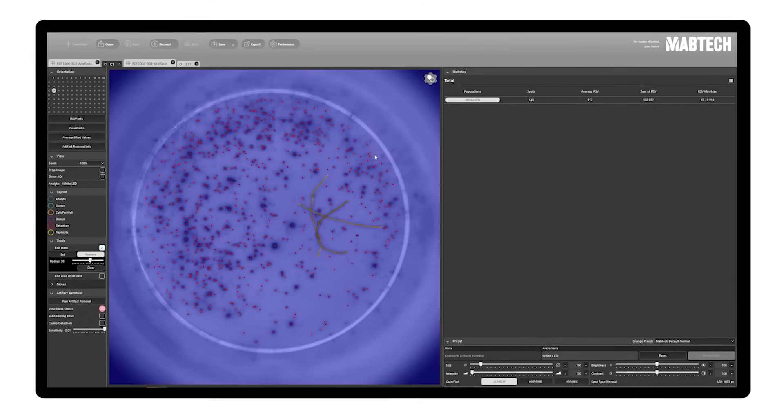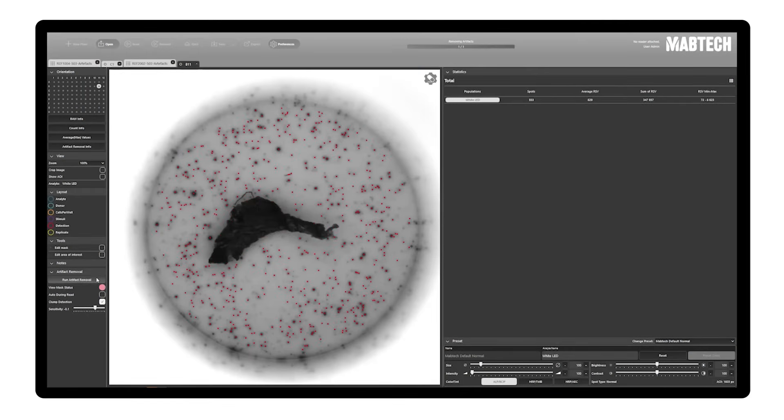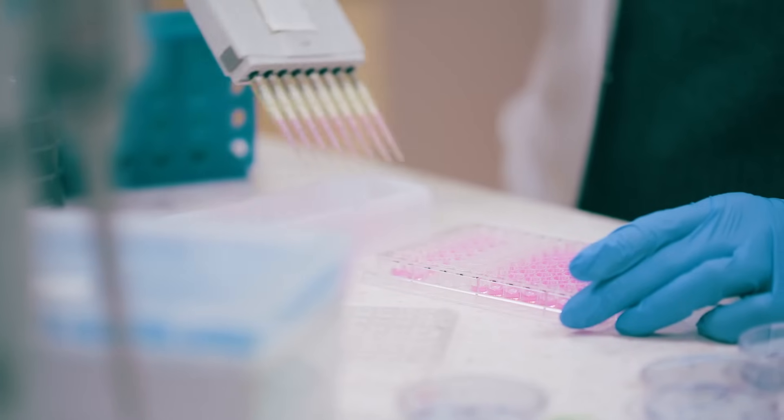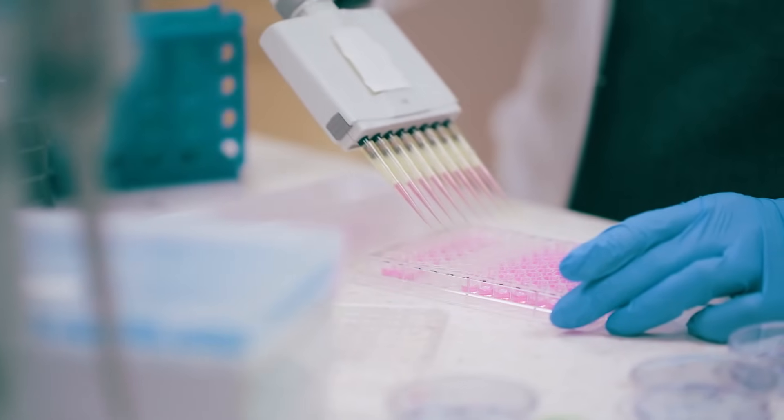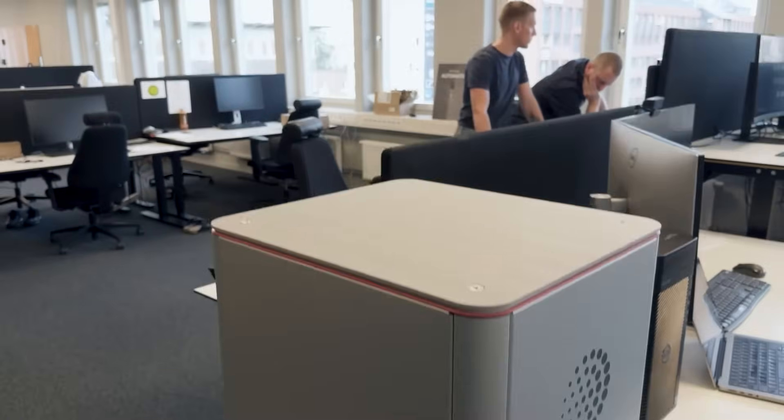Consequently, the results of Mabtec's immunoassays are accurate and trustworthy without requiring human intervention. Automatically removing artifacts during the analysis of ELISPOT and FLORISPOT results can be essential in order to generate high-volume operations and trustworthy data. Together with APEX integration into the robotic laboratory, this has now become a reality.